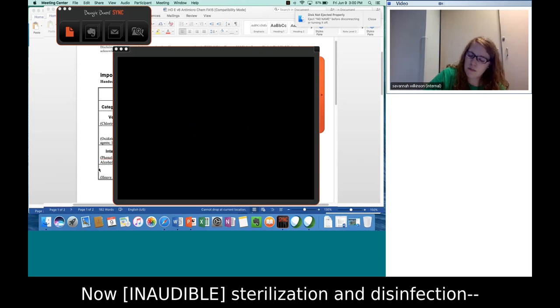Now, prion sterilization and disinfection.